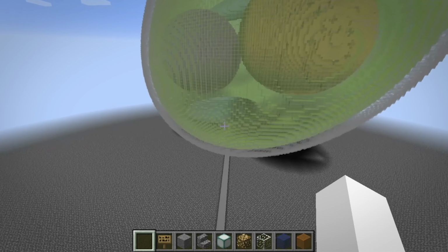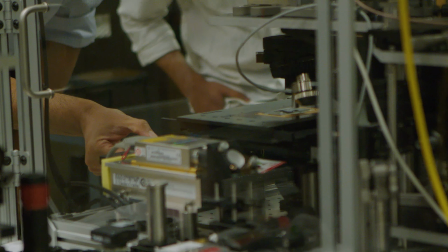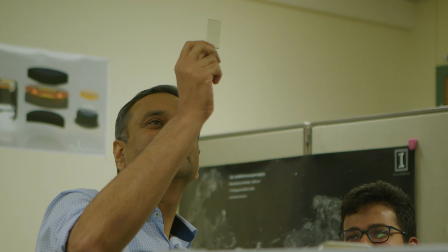The center is also pushing the frontiers of measurement science. We have been challenged by these models to make measurements that we thought were unimaginable. So when we try to measure them, we have 2 major approaches. The first one is to label the cells and find them with really high precision. The second one is to record data from components in the cell, molecules, small molecules, those that cannot be labeled. And there we're using infrared spectroscopy because we can get the native chemistry directly from the recorded data.